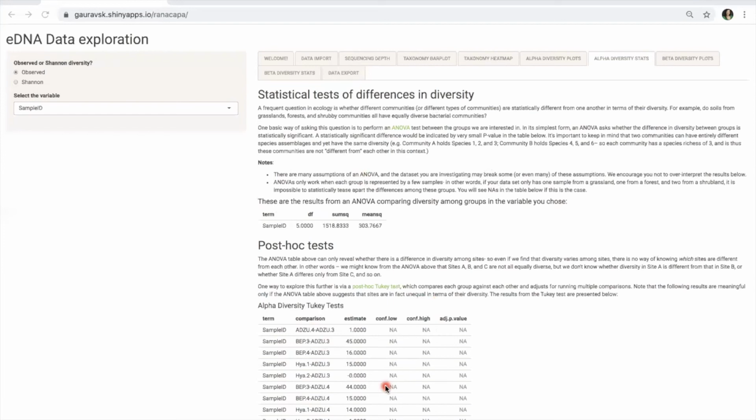If your class only has 2 different treatment types, then you might just want to skip this step because there might not be anything that can be calculated for you. But if you do have 3 or more, and also if you have at least 2 replicates for each treatment type, then you will be able to do these analyses.